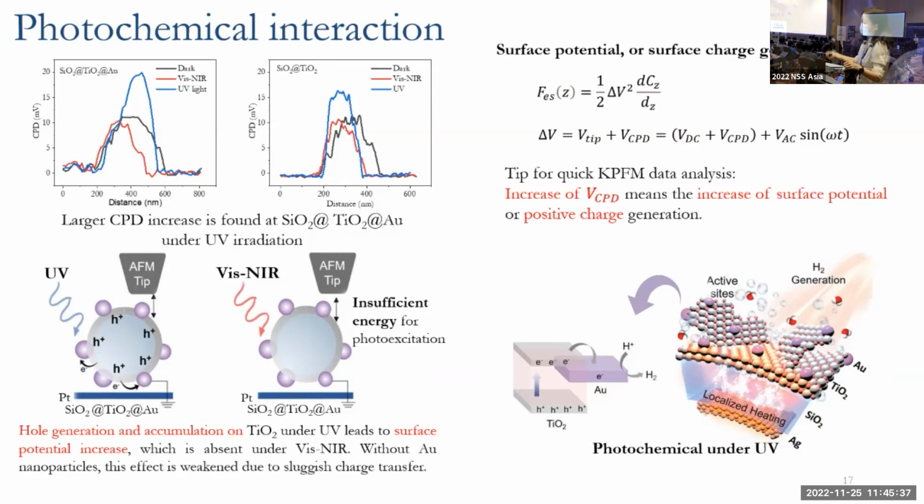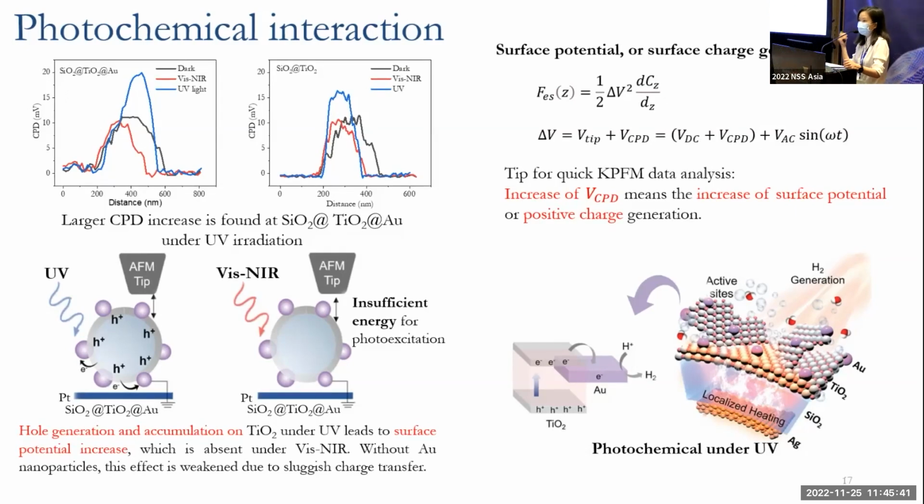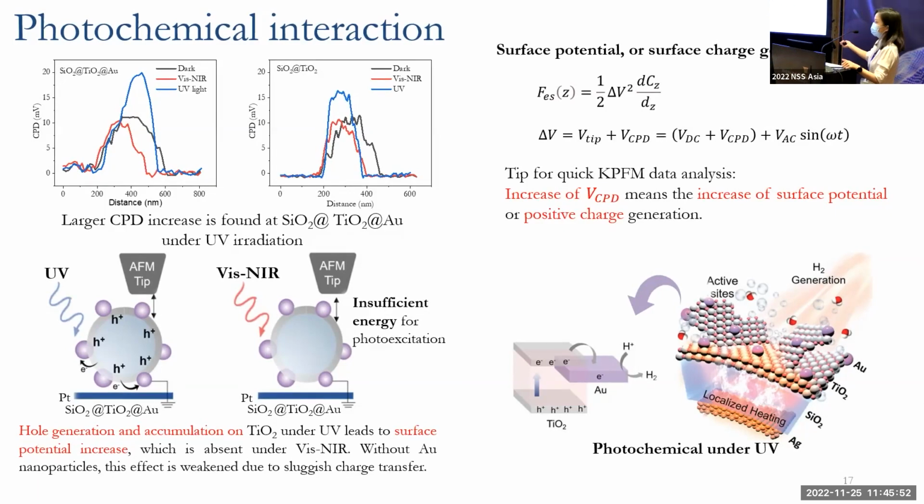Okay, this study also shows a nanoscale image of the photochemical interaction between the UV light and the hybrid photocatalyst.